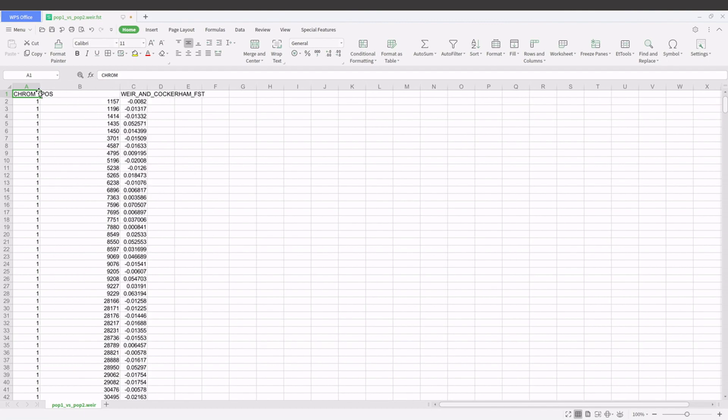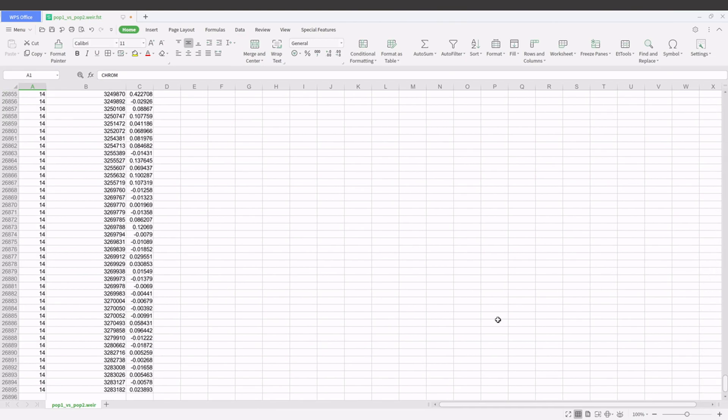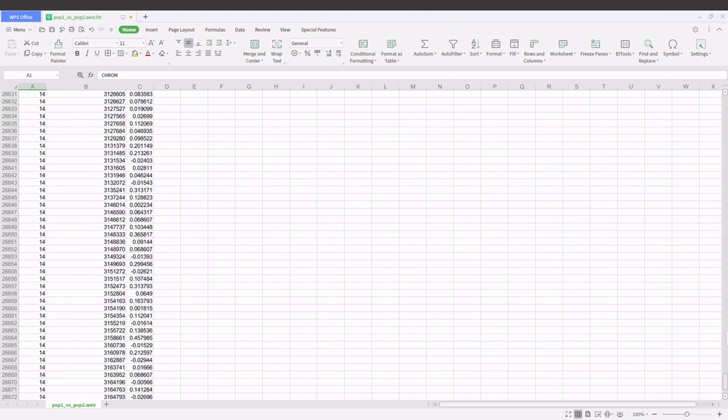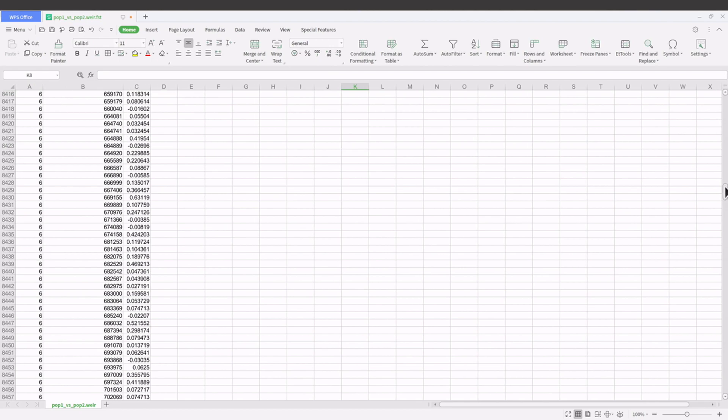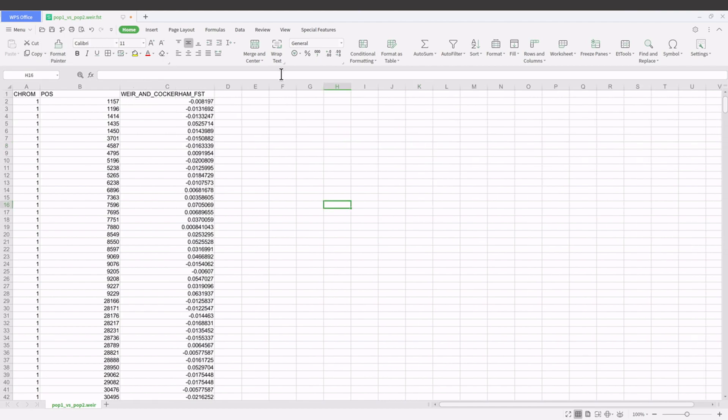Okay, so you have chromosome 1 up to chromosome 14. Okay, because we are dealing with Plasmodium falciparum isolates. So chromosome 1 to 14 and then we also have the position and then the FST values. So that's about it.